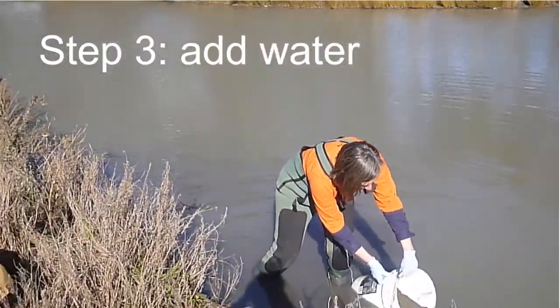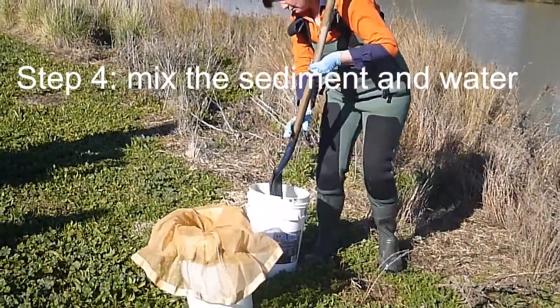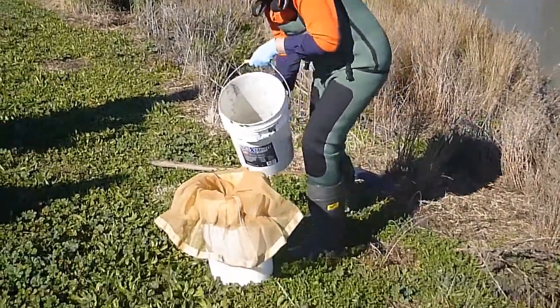Then you add water to the bucket to enable filtering. Mix the sediment and water together with your shovel. This will enable the sediment to filter better through the filter nets.